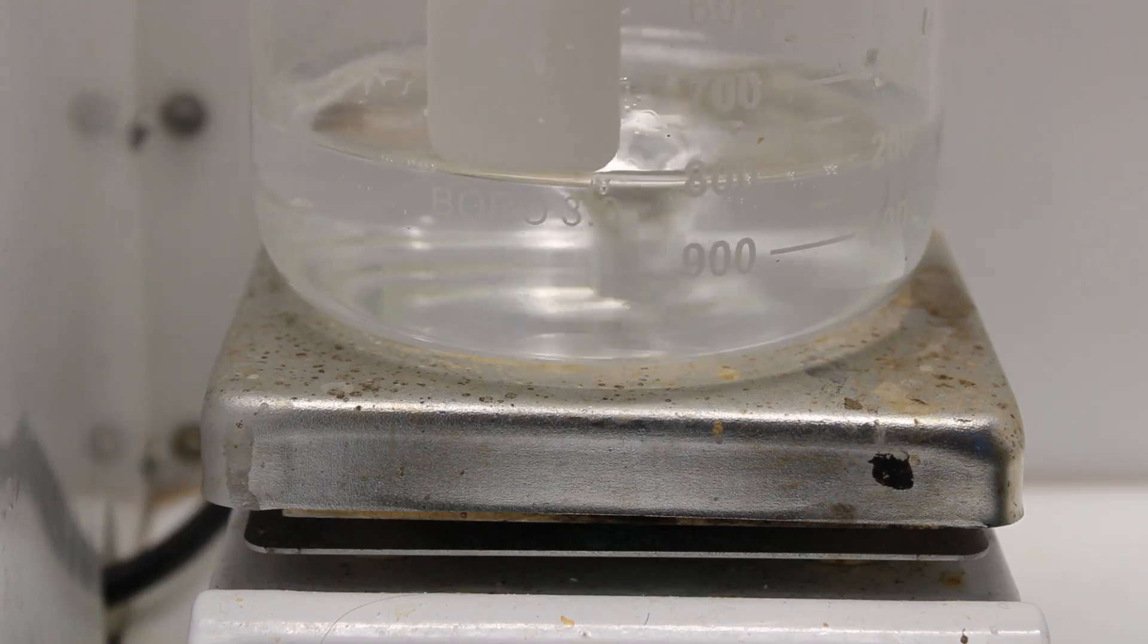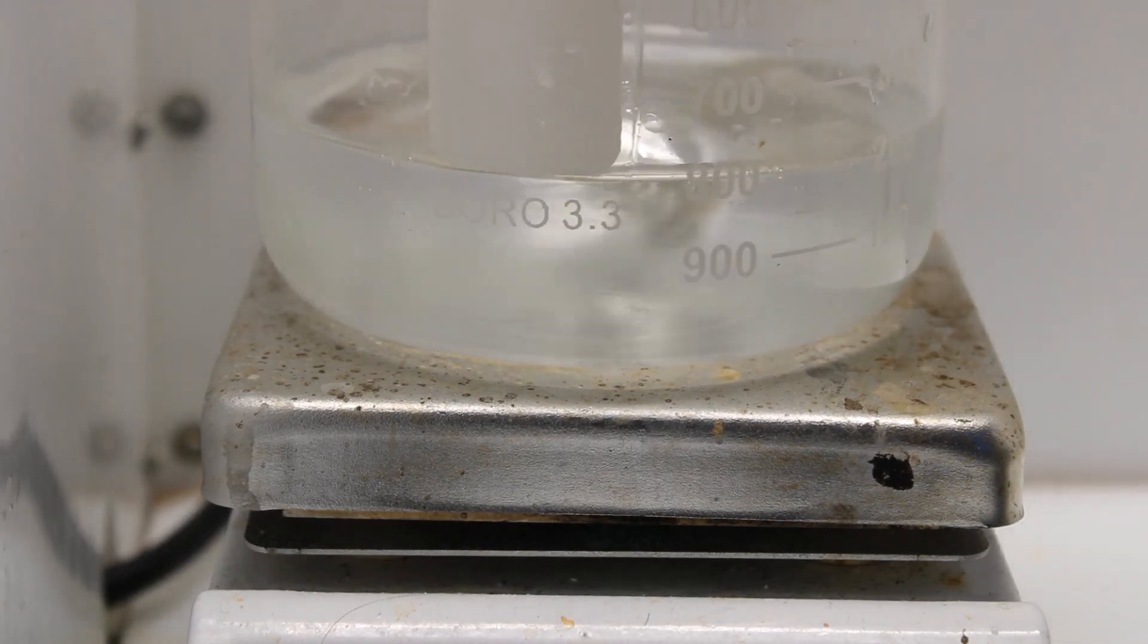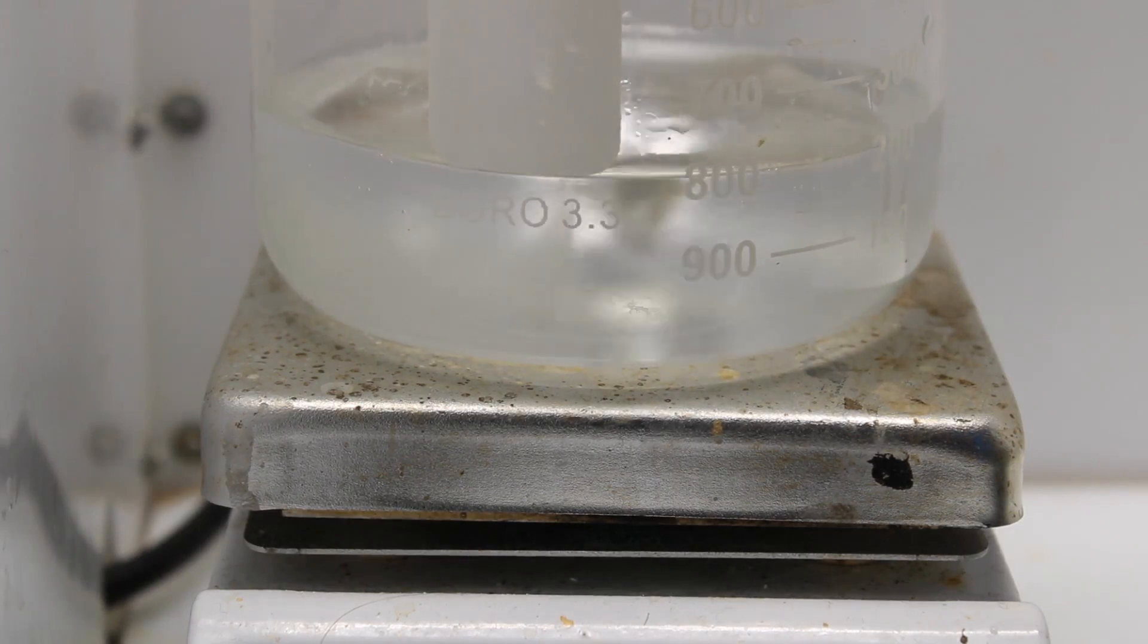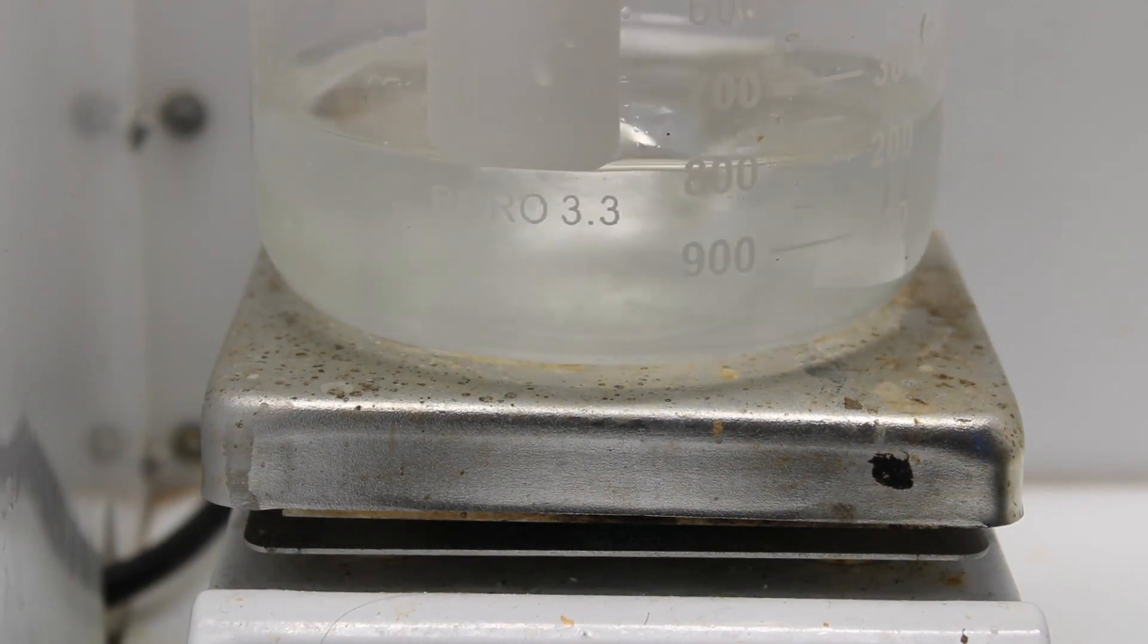First, 30 ml of sulfuric acid is diluted cautiously with 200 ml of distilled or deionized water. This represents a 1.1 times molar excess.